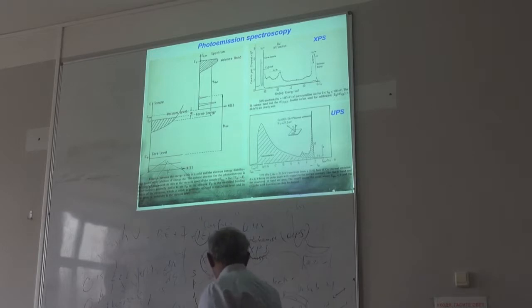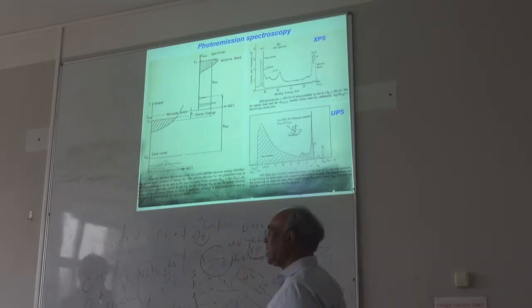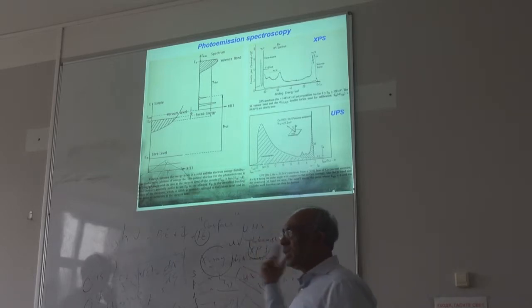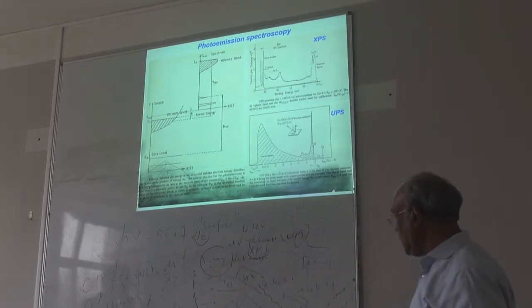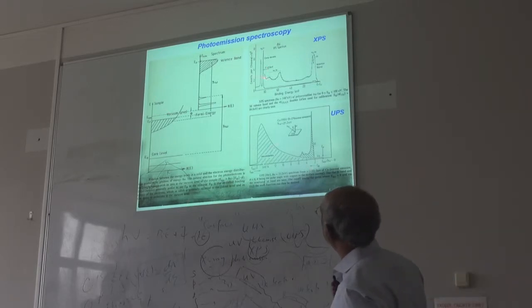We have another chamber where, instead of X-ray, we have a UV source. So we just shine UV light on the sample and look at what is coming out. Again, we use the same detector. You can look at the outcoming energy from the UV light. In the UV light situation it is different, because UV light only excites valence electrons, not the core electrons.